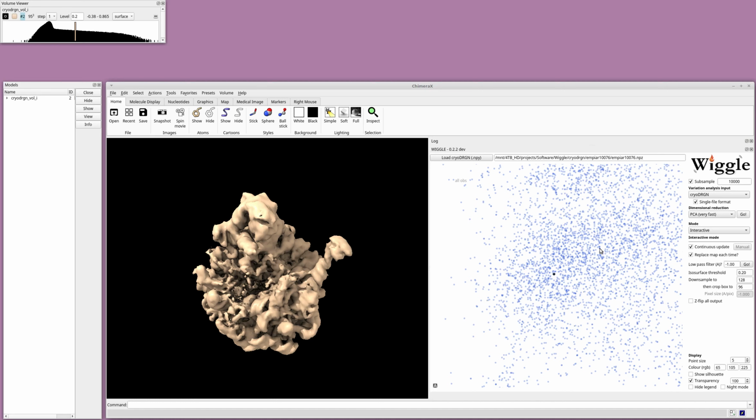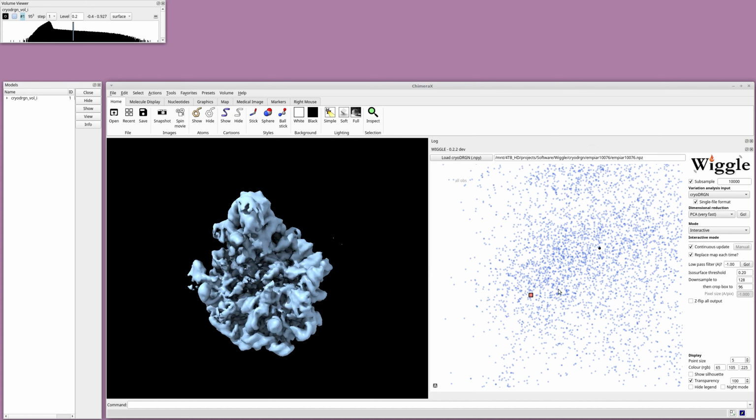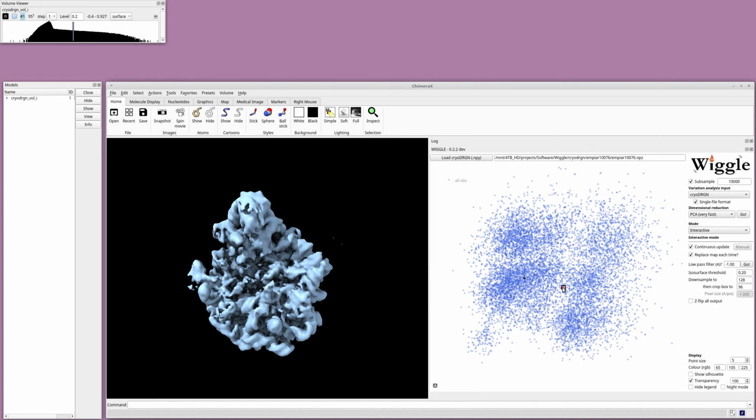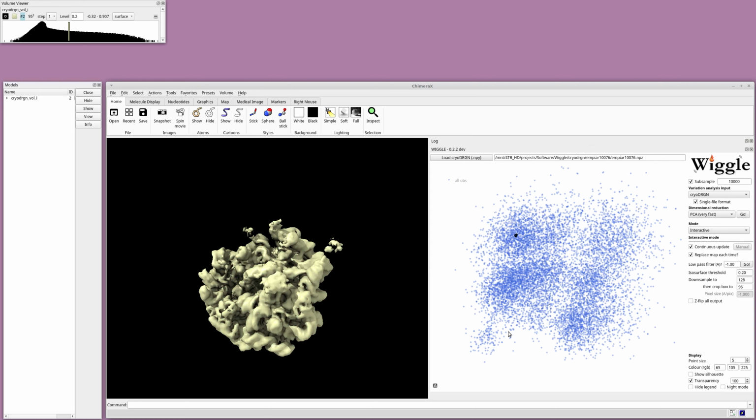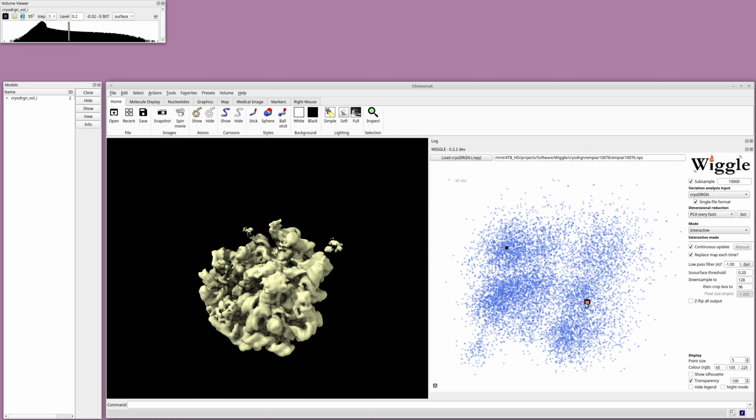So hopefully what this provides is an accessible tool to allow you to more intuitively engage with your data, given that this two-dimensional space here is a representation, in this case, of, I think it's an 8-dimensional space. Oh no, it's a 10-dimensional space.